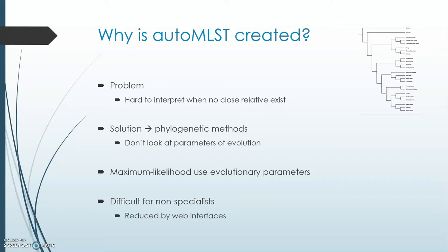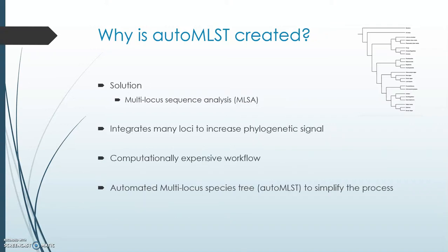These assure high confidence in evolutionary reconstruction, as a choice of model can give varied results, but this process can often be insufficient in categorizing species splits using the 16S data alone due to limited phylogenetic signal in the highly conserved sequences. A solution to this is the use of multi-locus sequence analysis, or MLSA, a technique that integrates many genomic loci to increase phylogenetic signal.